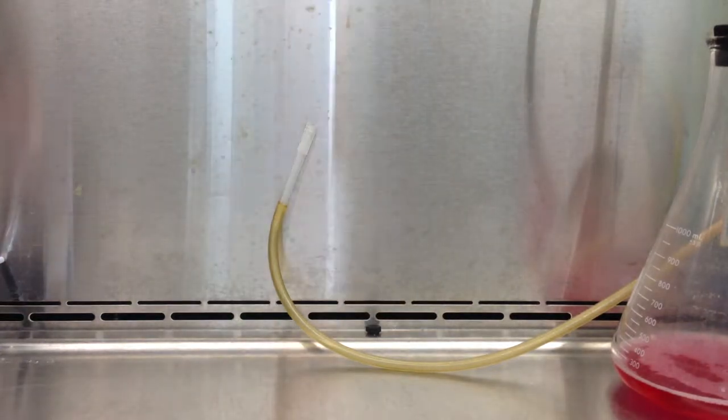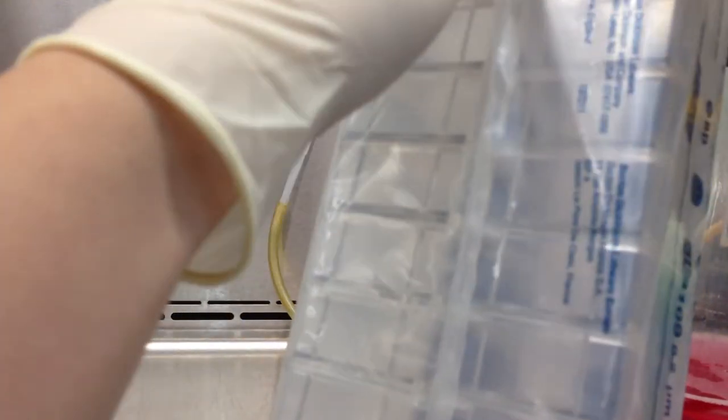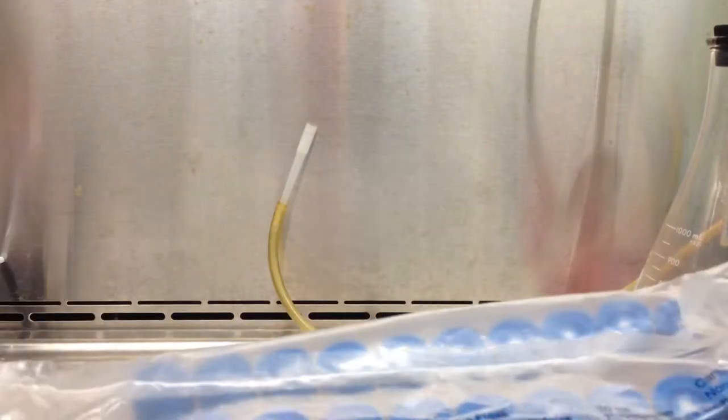And of course, spray everything when you bring things into the hood. Make sure to spray the cap very liberally. Still have about a minute, minute and a half left to get the T175s out of the incubator.